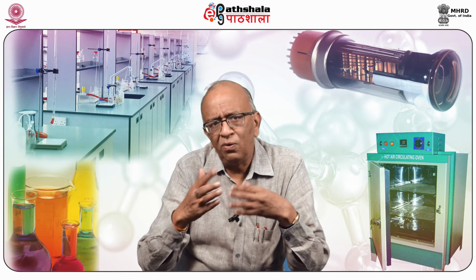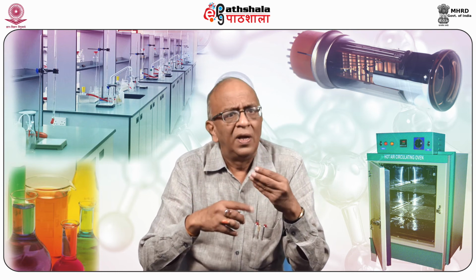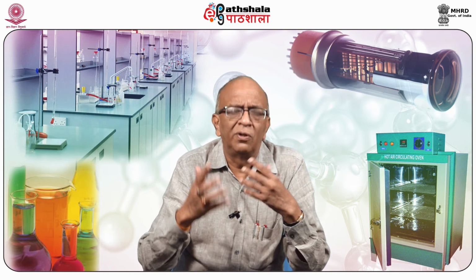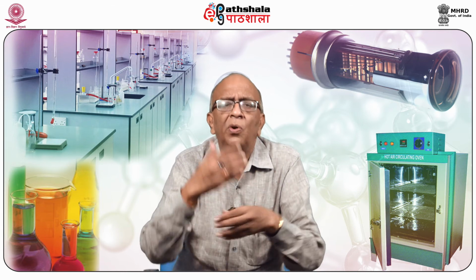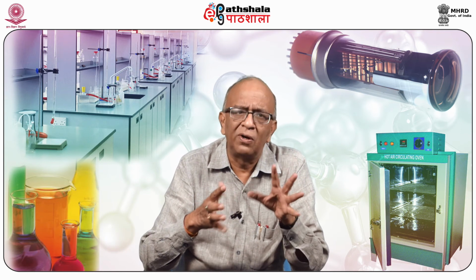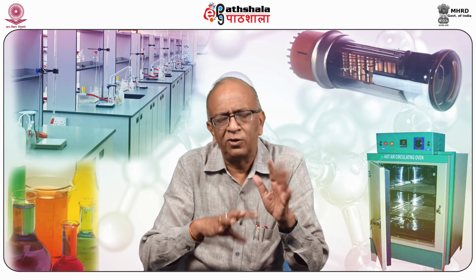Also, to find out whether a mixture contains two substances, three substances, or four substances, all can be found out for that purpose. It is extensively used, even with small slides of biology, which are used for spotting purposes. They are used for testing the routine purity of a substance, maybe an organic substance, maybe a biochemical material, and it can be done in a very short period of time. For testing purity in any mixture or any type of synthesized compound, this is the best method.